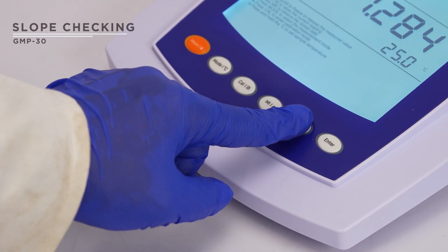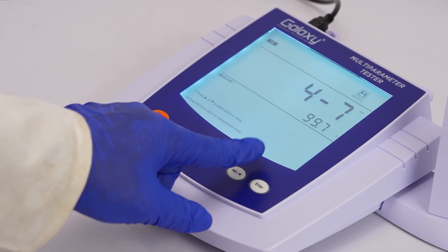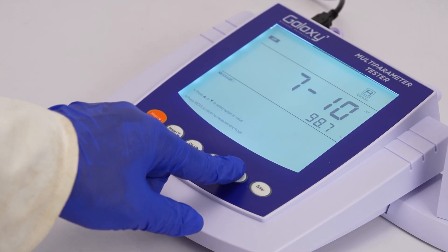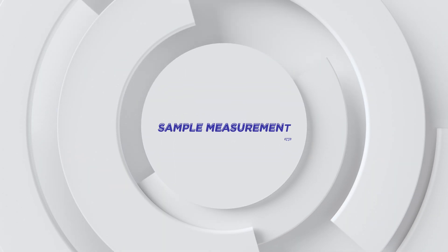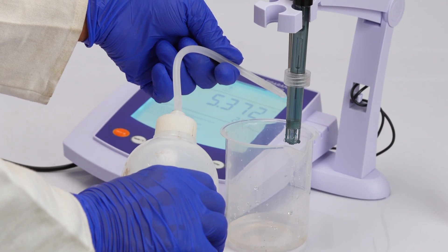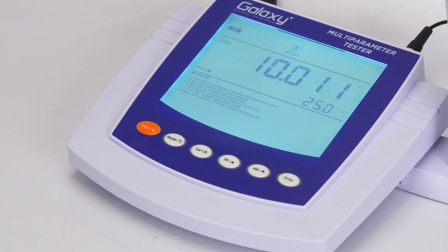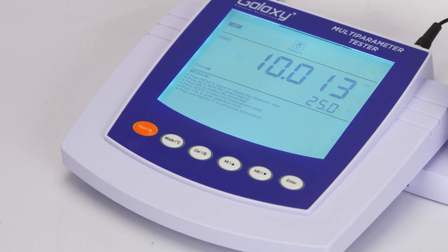Press the MR key twice then press enter. After that, press the MR key again to check the slope of the electrode following calibration. Rinse the electrode with distilled water and place it into the sample. If auto hold is enabled, the meter locks the measurement when stable.